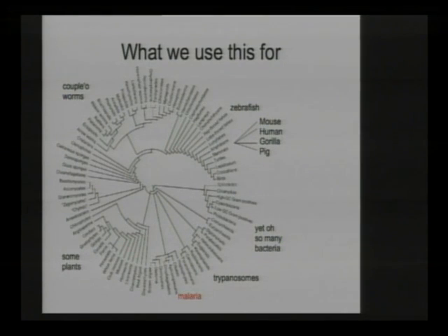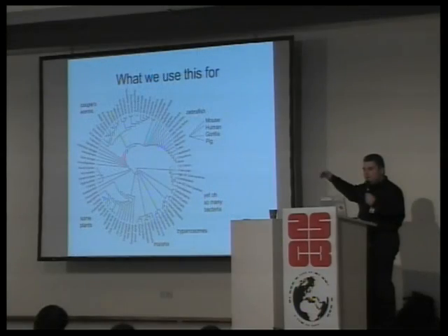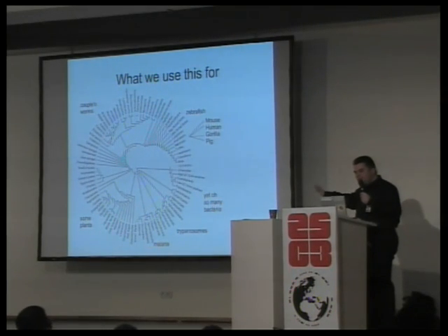What we can do is, if we have a reference genome, so the same species or a related species, we can map this stuff back and see, okay, all this is identical. I see this in the reference and in the new stuff. And then we can look at the rest and say, okay, this kind of fits here, so maybe it's just a small variation.